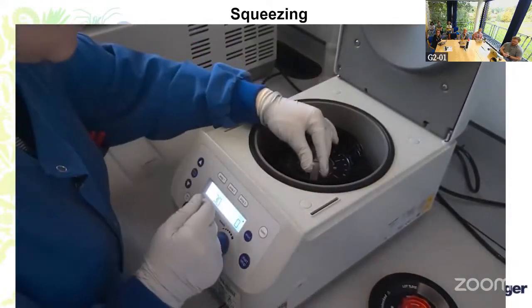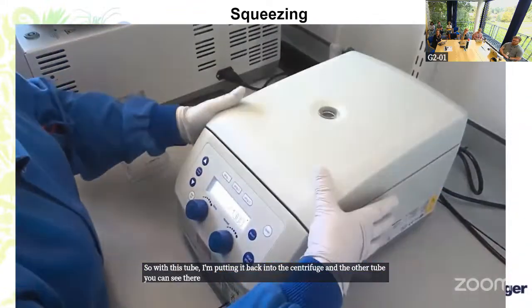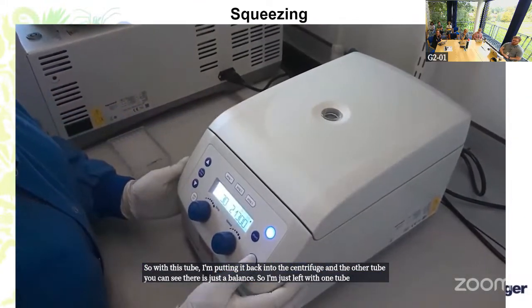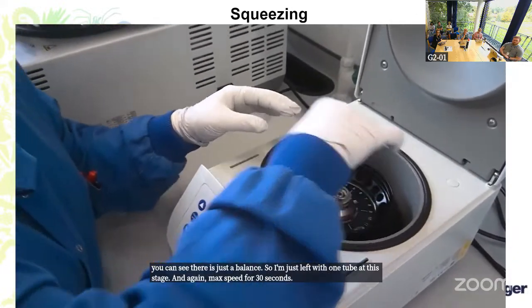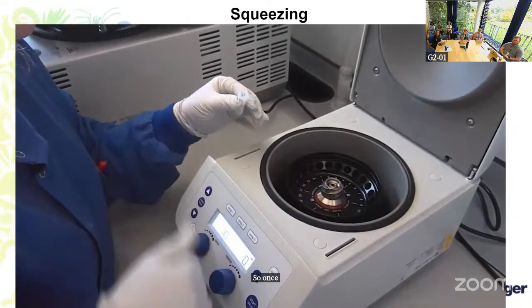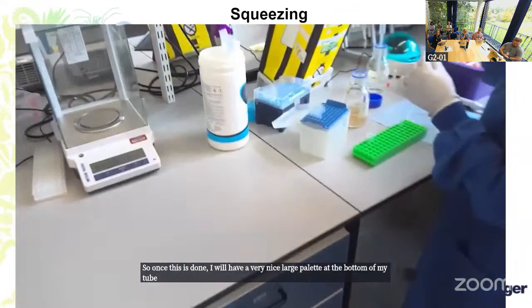So with this tube, I'm putting it back into the centrifuge, and the other tube you can see there is just a balance. So I'm just left with one tube at this stage. And again, max speed for 30 seconds. So once this is done, I will have a very nice large pellet at the bottom of my tube, hopefully.